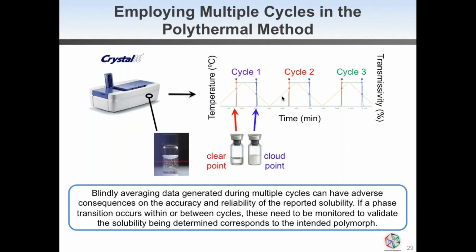Because it might happen that in the cooling process, we are actually nucleating a different polymorphic form than we were starting with, and we do not have control over the reported solubility. We also might see solvent mediated phase transformation, and therefore we are always recommending, and we cannot stress this enough, that solid state characterization is crucial when we are reporting solubility data.